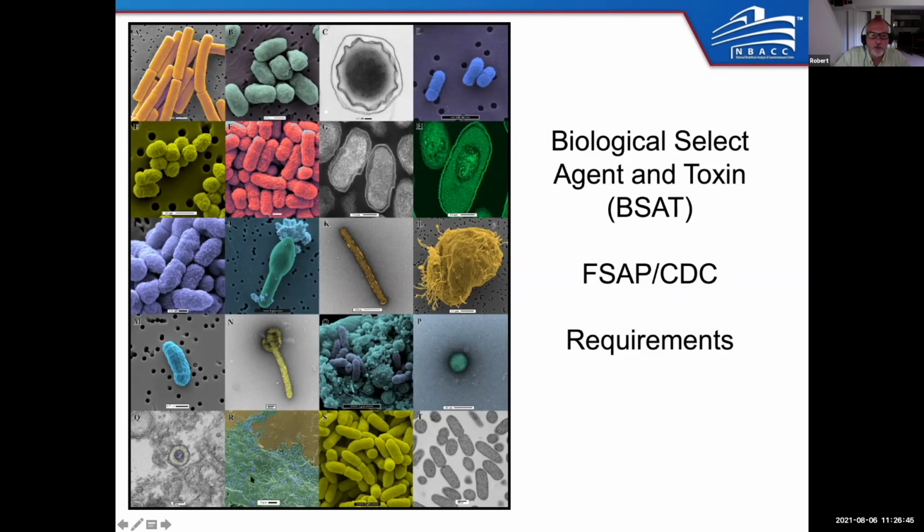And in R, you have tissue culture cells from the surface. You're looking at the surface of these cells, and the tan or gold cells right here are pretty much uninfected. The green cell here is heavily infected with SARS coronavirus 2. And all the blue and purplish things you see budding out of the surface and rebinding to the surface of this cell and to the surrounding cells are the SARS coronavirus 2 particles as they're being released.